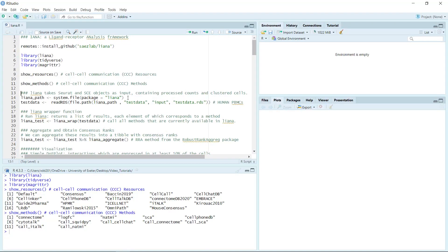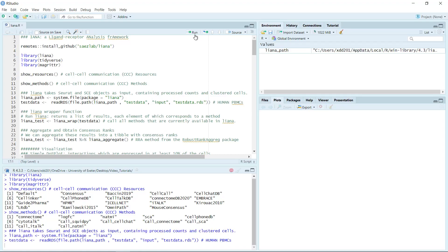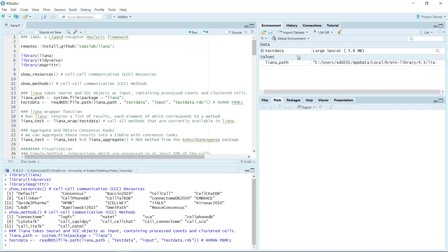For the demonstration, the package has a small demonstration dataset derived from the human PBMC single-cell RNA sequencing data. Let's use the demonstration data for today's video tutorial because it is very quick to run. You can see I loaded the demonstration data — it is a Seurat object, only 5.8 megabytes.